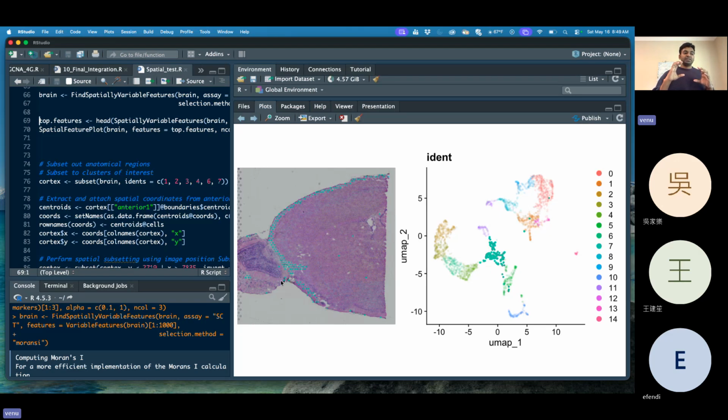Maybe, as I said, for example CD4, maybe this region of epithelial cells is shared with CD8 cells, or these epithelial cells are shared with some fibroblasts. So that is where we will get the cell-cell interactions and all these analyses. That is what we found with the deconvolution method. Next time, I am going to explain the deconvolution methods in detail.